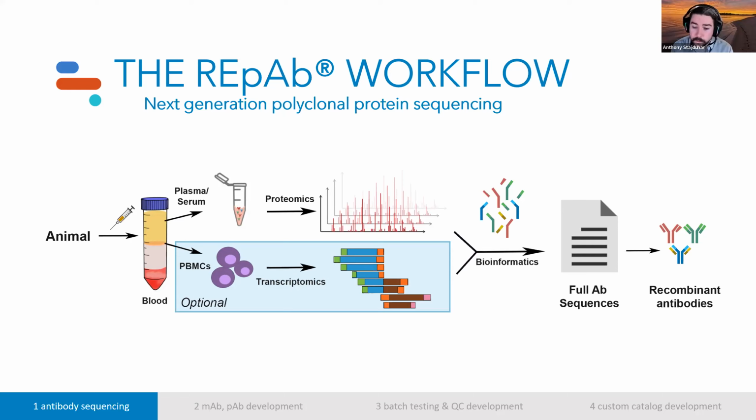Optionally, we can also work with the NGS data that we would derive from a PBMC extract. So we've done this now in a number of species as well. It is truly an optional step, although I would say that it would help to increase the breadth of the antibody space in which we can explore. Although in many instances, the B cells are not necessarily accessible, that's not a problem.